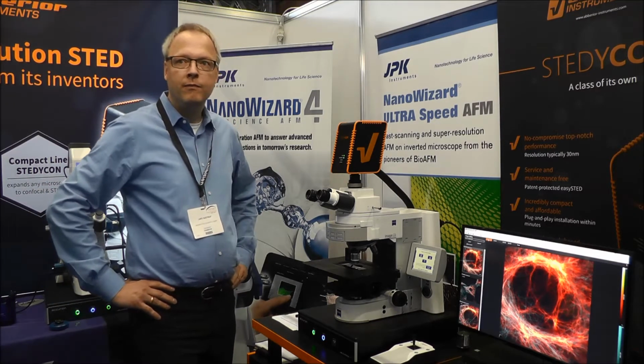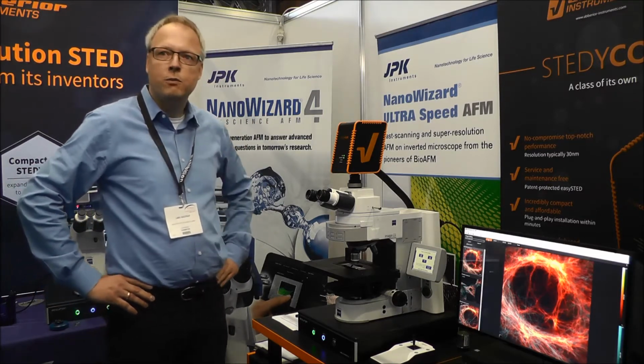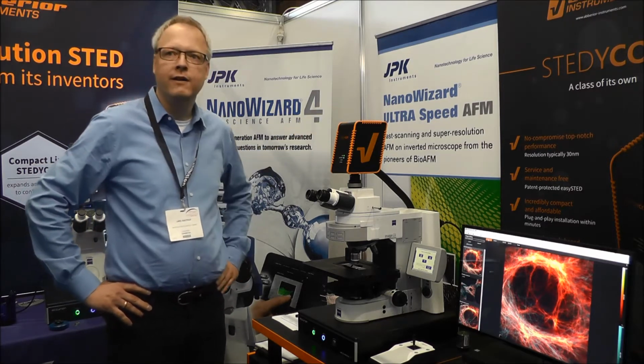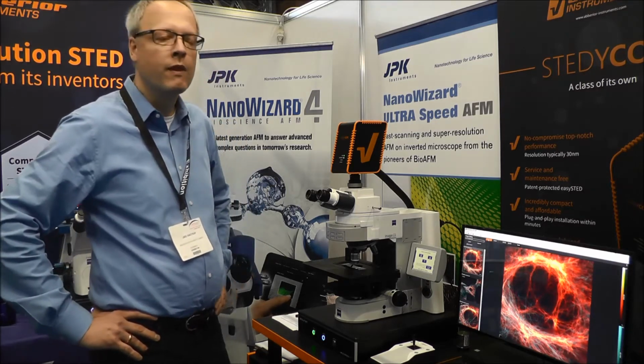Okay, and so is everything in that box? Well, all the lasers are in a base supply unit, but all the optics, the scanner, and so forth, that's all inside this small head here. And I'm guessing there's some software involved?